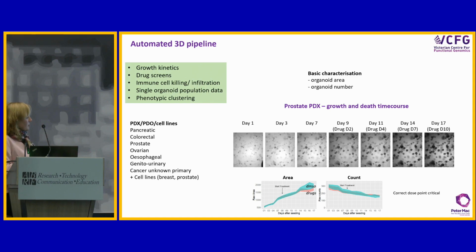So here's where we started our treatment, and you can see that they get very dark looking as they're dying, so it's an easy visual readout in black and white there. And then we can start to score for size, invasive type of features, tumour heterogeneity is certainly one as well. So that's just a quick snapshot of the utility of doing something in bright field.